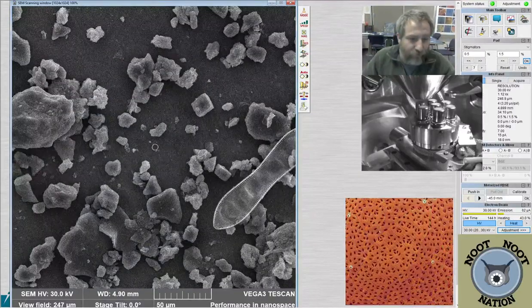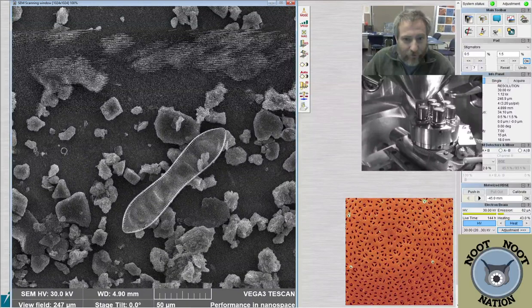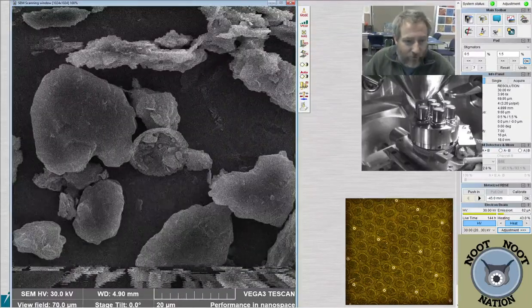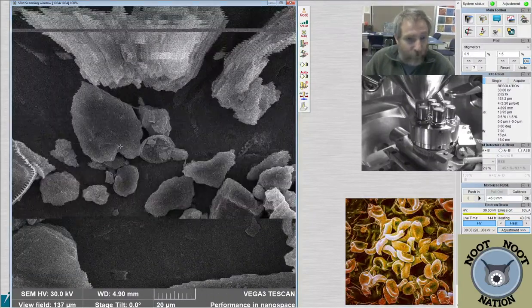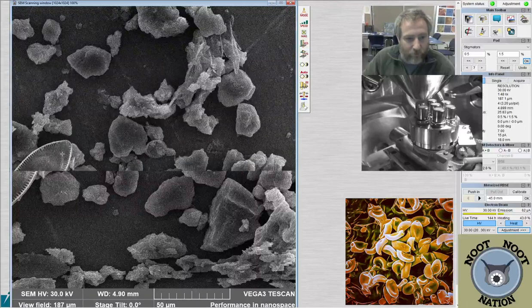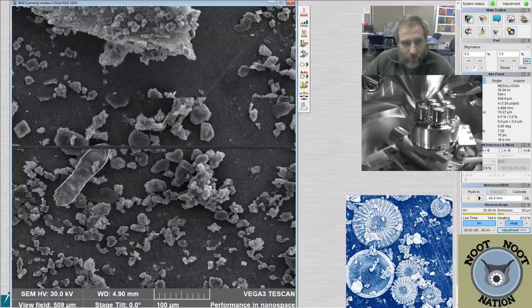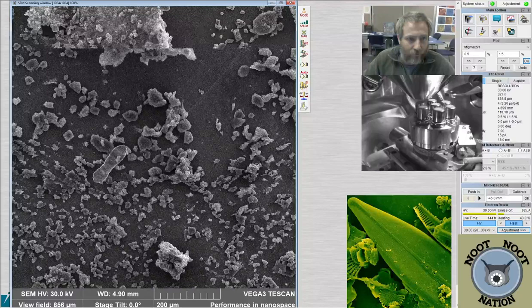It started off when I was out on the Wabash River doing a little kayaking one day when I first got here. We collected some diatom samples from the river just to see what was in it, because I thought it'd be interesting to check out the water and see what's here. It's when I'd first moved to Terre Haute, so this was fall of 2012. I brought some plankton nets with me and collected some samples, and then shortly afterwards processed them and looked at them in light microscopes.